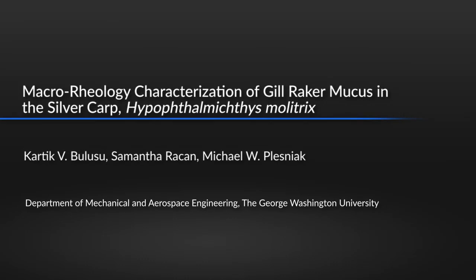The significance of this protocol is that it allows an accurate rheological characterization of non-Newtonian biological fluids such as mucus, especially when only very small sample volumes are available.